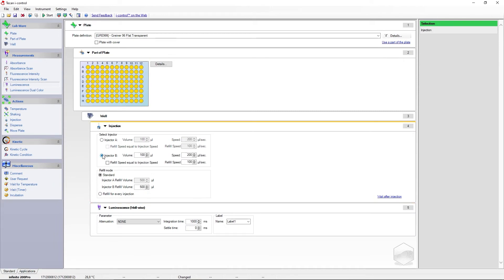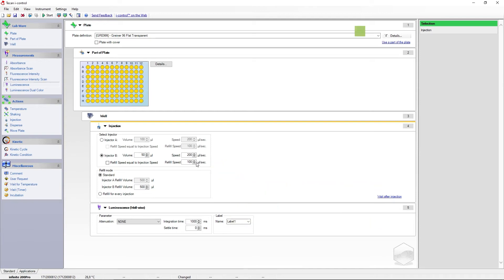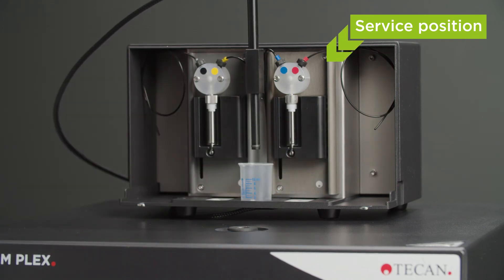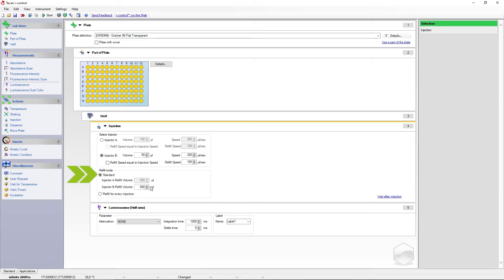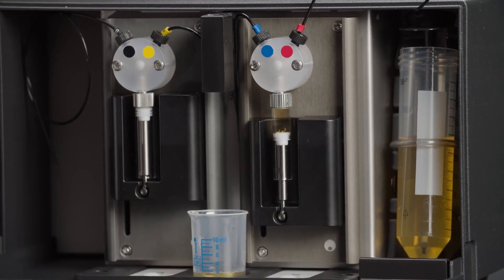Depending on the configuration of your injector module, you can select injector A or B. The volume can be defined depending on your requirements. The speed and refill speed are dependent on the viscosity of your liquid. You can optimize the speed settings in the service position to find the correct parameters. You can also choose either a standard refill mode or to refill before every injection. When choosing the standard mode, the syringe will be refilled before the liquid is fully depleted.